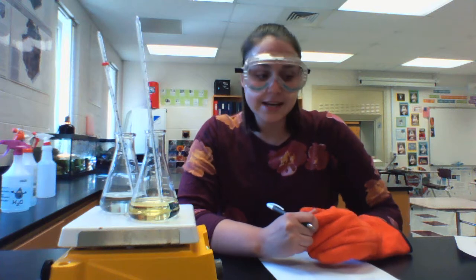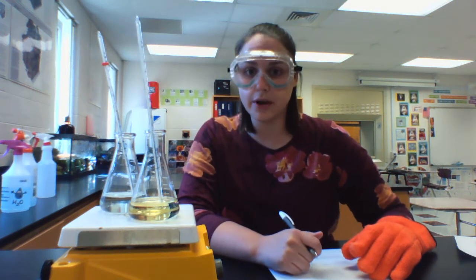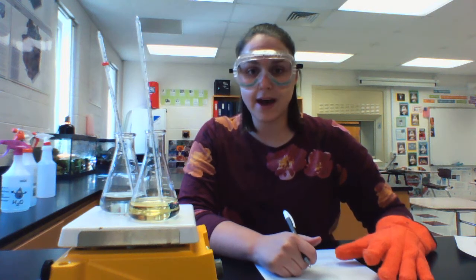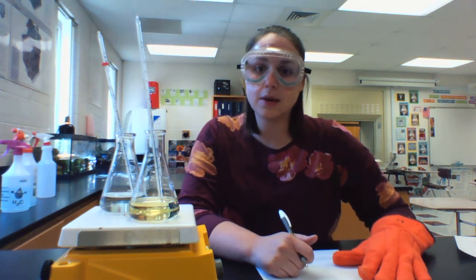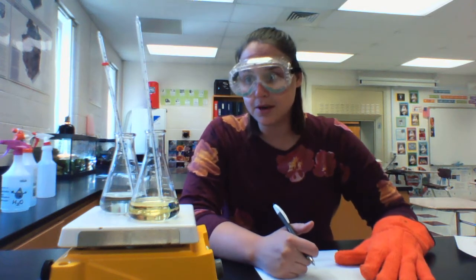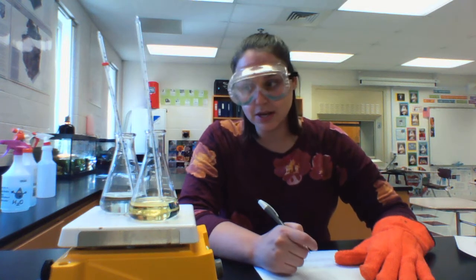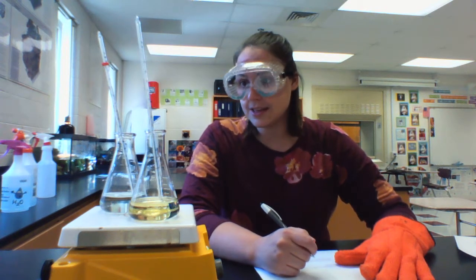What we're going to see in this lab is whether the water or the oil is going to heat up at a faster rate. And then you're going to think about your properties of water and why one of them might have heated up at a much faster rate than the other one. We're about 30 seconds in, so I'm going to give it another 30 seconds and then take a look.